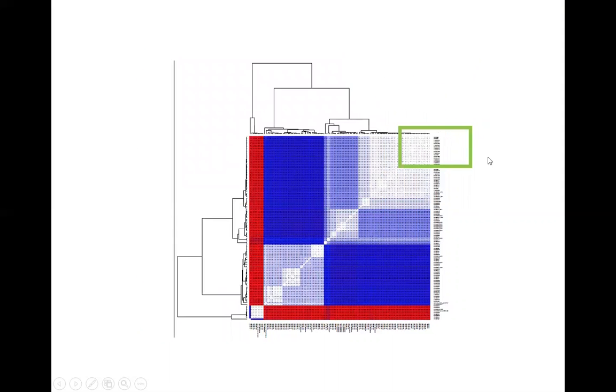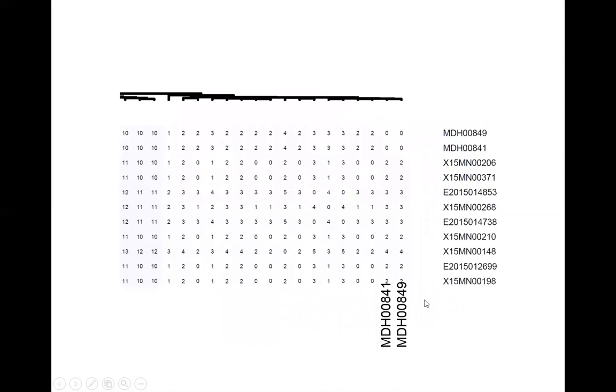Now, if we look on the other end, where we have very similar isolates, so the white side of that similarity matrix, we can see isolates that all differ by very few differences, from 0 to 4 SNPs. And again, we can compare two isolates and say this isolate and this isolate are basically identical with regard to number of SNPs, 0 SNP differences. So in this case, there's more opportunity for the end user to really look at all data by getting these similarity matrices. The more data we have, the more isolates we have, the more complex it obviously gets to look at those.